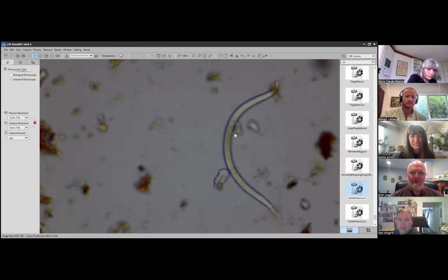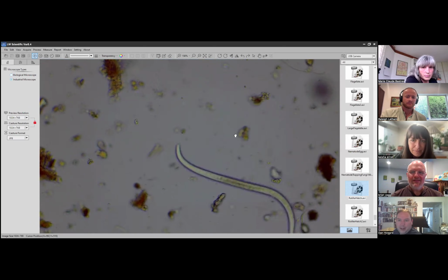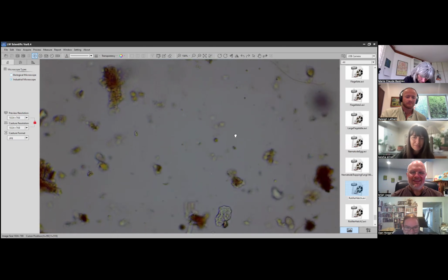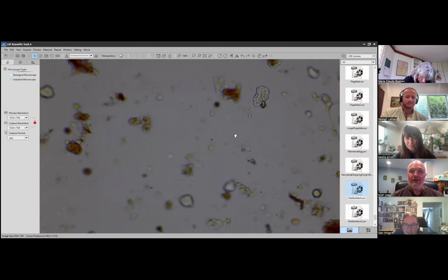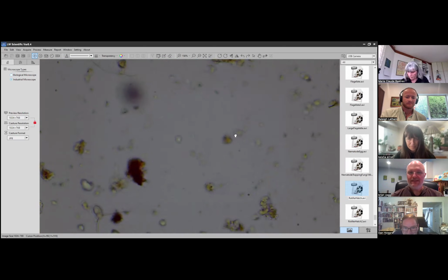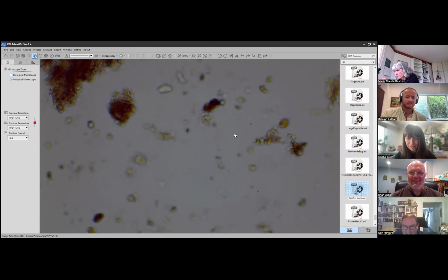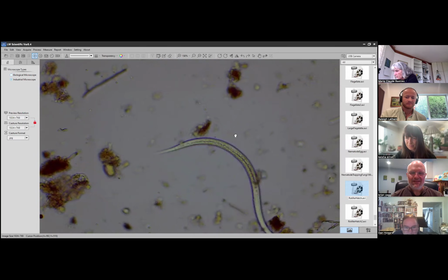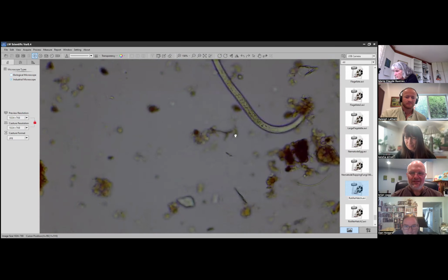Oh, there we go. There's a nematode. It's moving pretty quick. It hasn't slowed down much, but there's been a few in here. Were you able to identify it earlier, Dan? No, it never got to where I could identify.